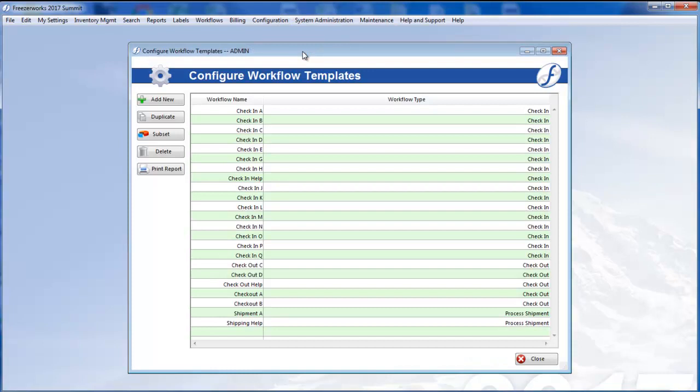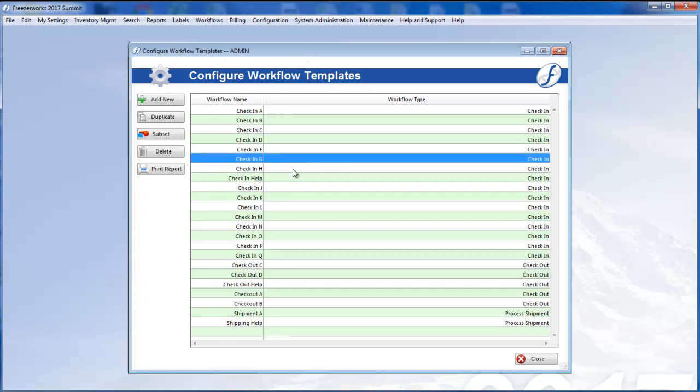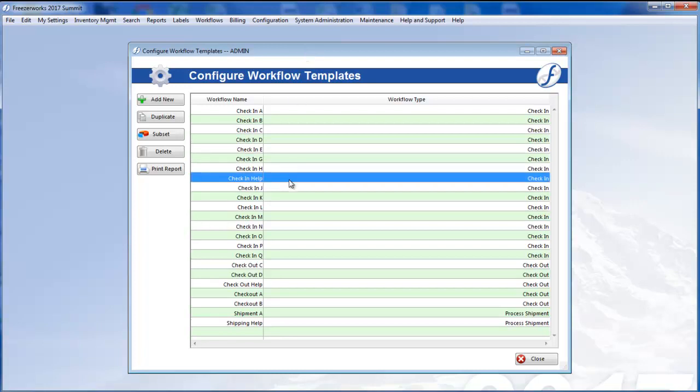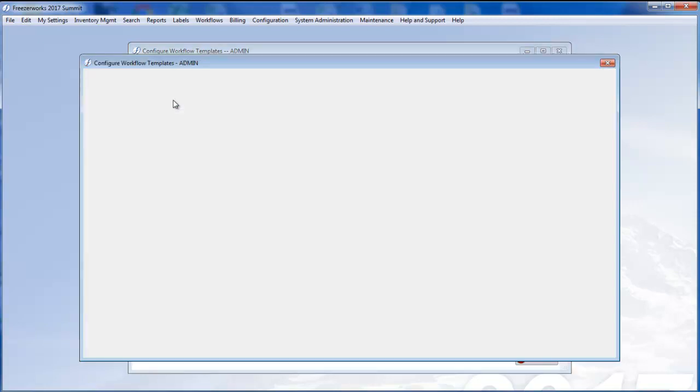This opens a list view of existing workflow templates. If you need to modify a template rather than create a new one, double click to open it and then follow along with the rest of this video. Otherwise, let's click Add New and get started.